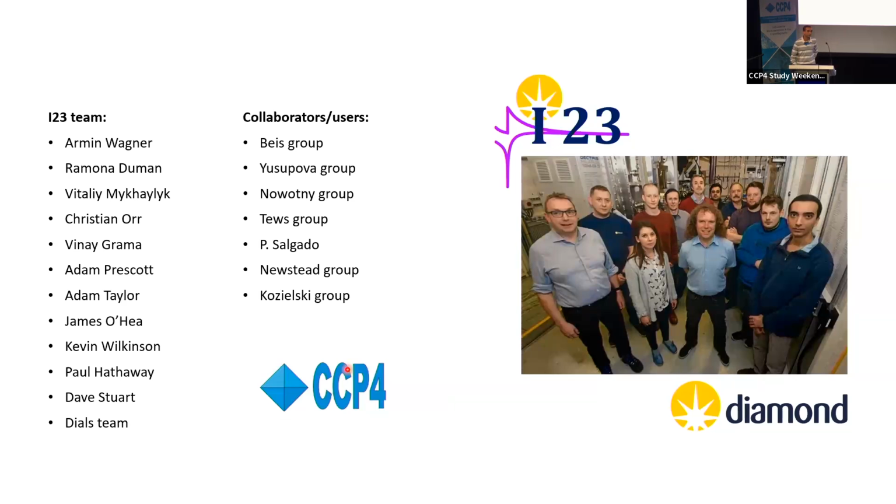A lovely talk. Oliver Smart, Global Phasing. Sorry, I should identify myself. Just to link your last example, which is very interesting, to Elspeth's quote, I have a question: if you've got a chlorine in your ligand, is it also worth deliberately burning it out and producing radiation damage? Do you think you'd get a signal that way?